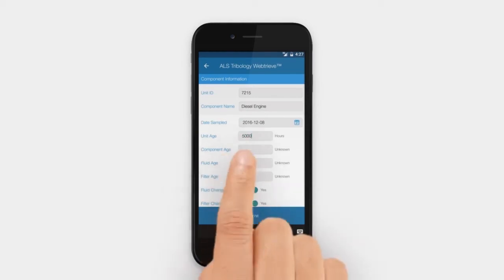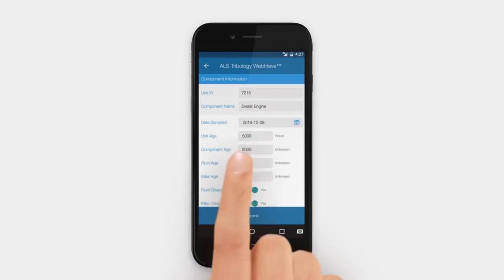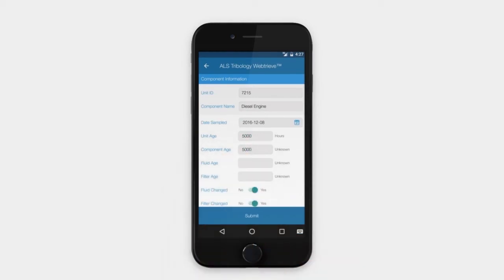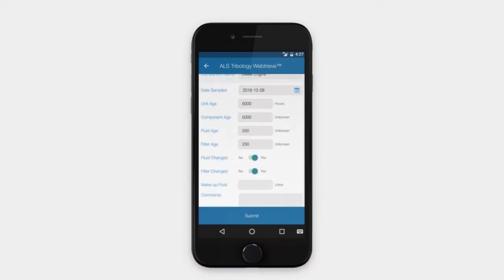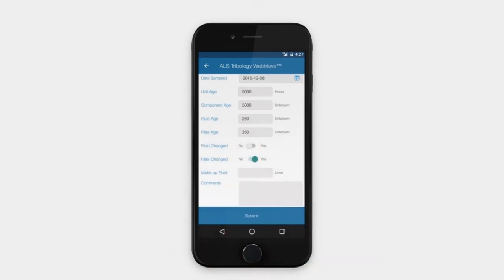This is where you populate the date sampled, the unit age, the compartment age, and the fluid age. You can indicate whether the fluid or filter were changed by selecting yes or no, and if any makeup fluid was added.